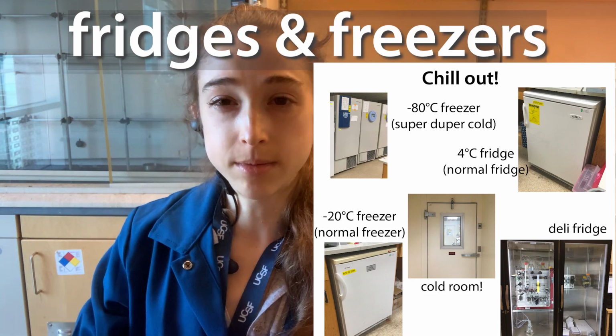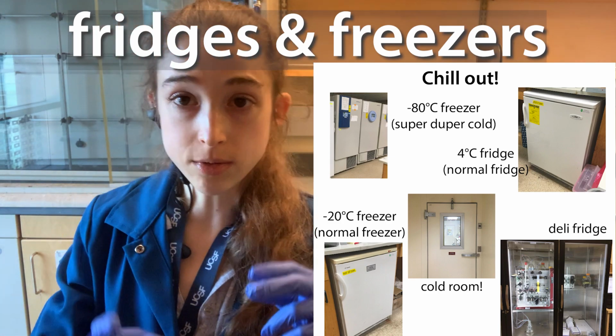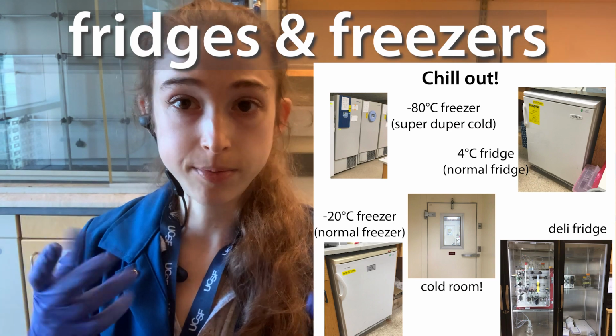Okay, now we are on to things that look more like what you would see in a house: refrigerators, and also freezers. Refrigerators, you might see referred to as keeping things at 4C. That's a refrigerator.